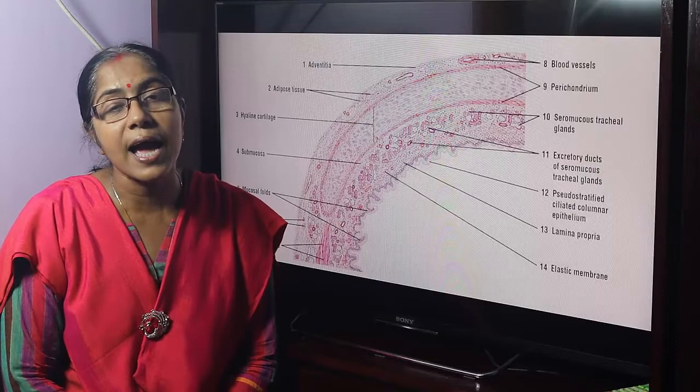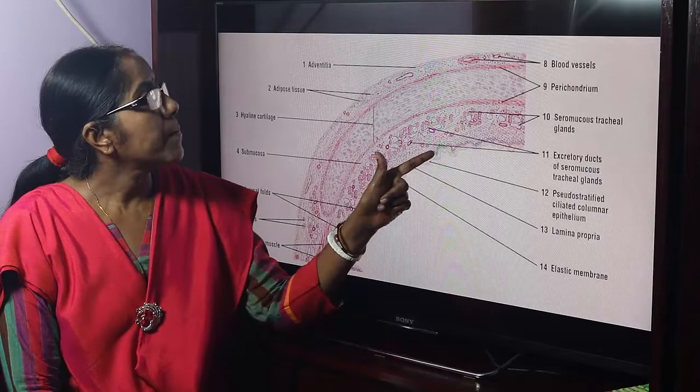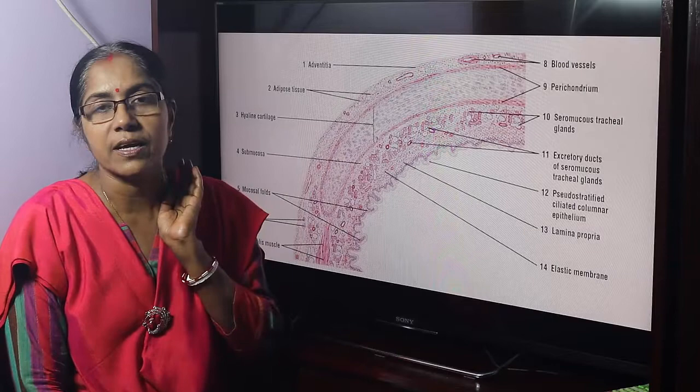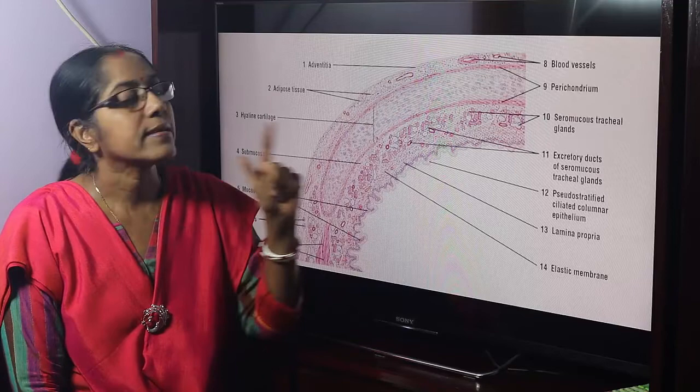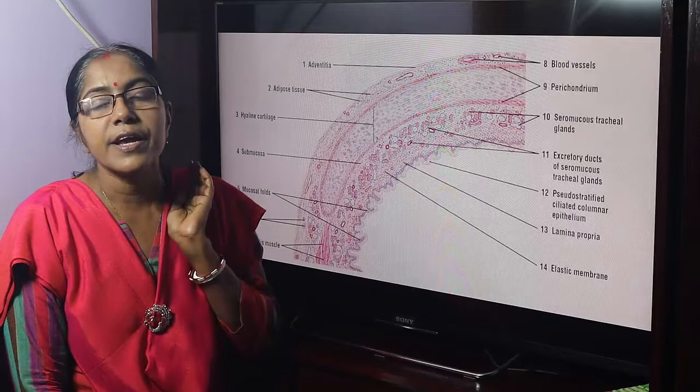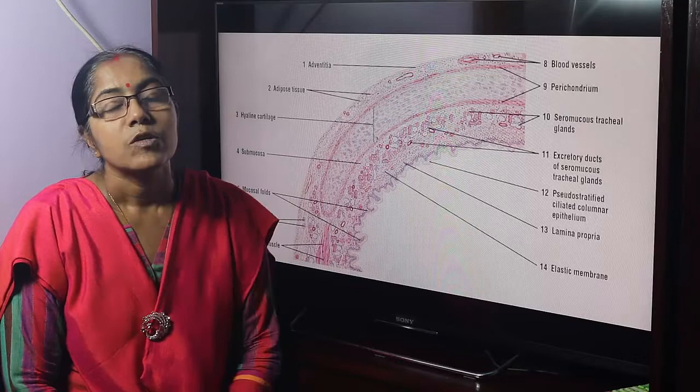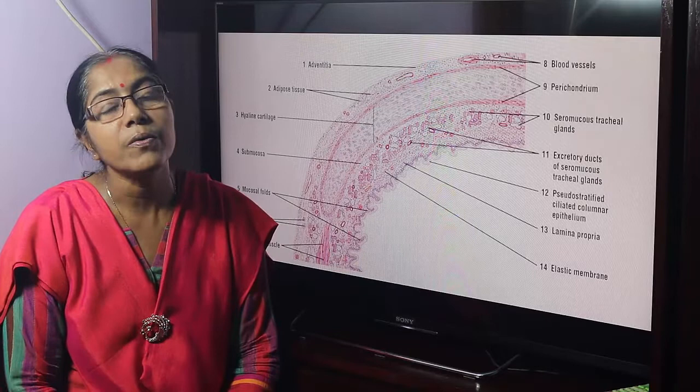What are the identifying points? The section shows four layers: mucosa, submucosa, hyaline cartilage, and adventitia. The core of the section is formed by hyaline cartilage covered with perichondrium. The mucosa is lined by pseudostratified ciliated columnar epithelium. So, the tissue section is a slide of trachea.